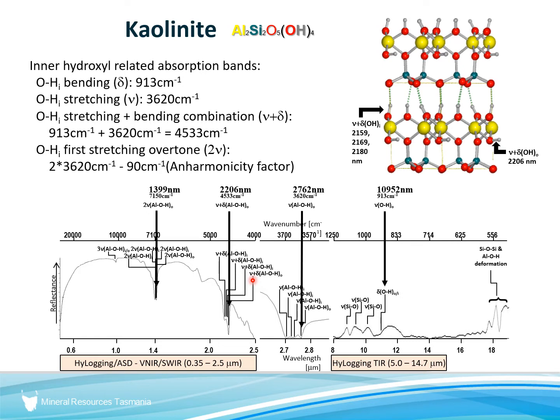Okay? Now, we don't need to deal with those details in the hyperspectral geology we do. It offers wonderful opportunity for characterizing things in detail, but we don't have the spectral resolution to see that. But we can see that it's an AlOH bond, so typical of a white mica, will cause an absorption of this shape and wavelength here.